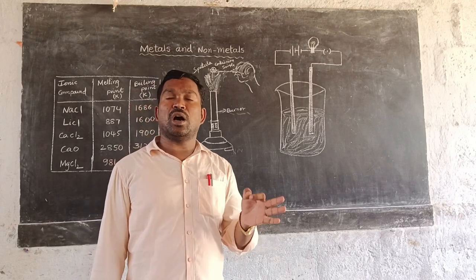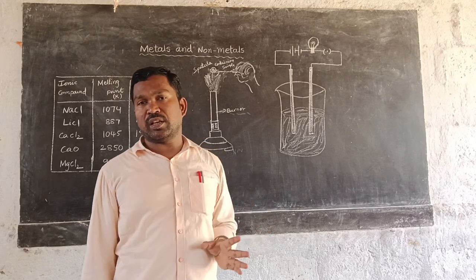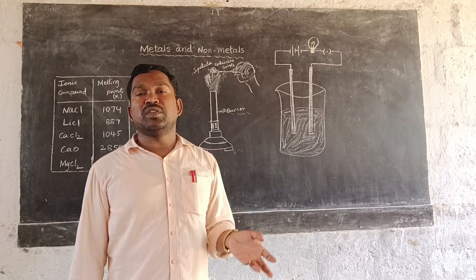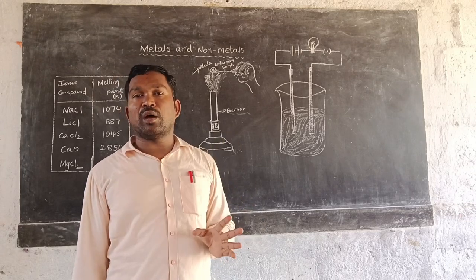Next, try to dissolve all the salts in water, petrol, and kerosene. Observe which salts dissolve in water, which substances remain insoluble, and what happened.